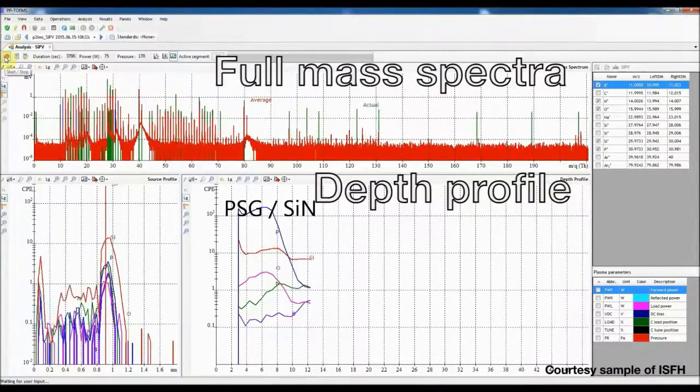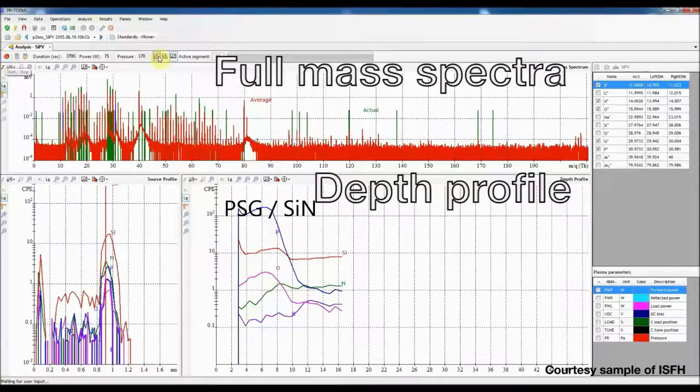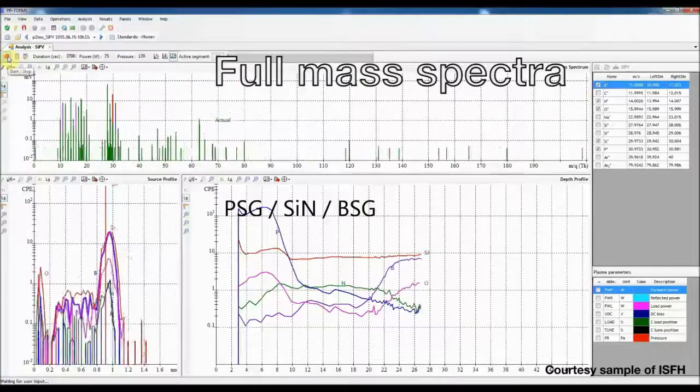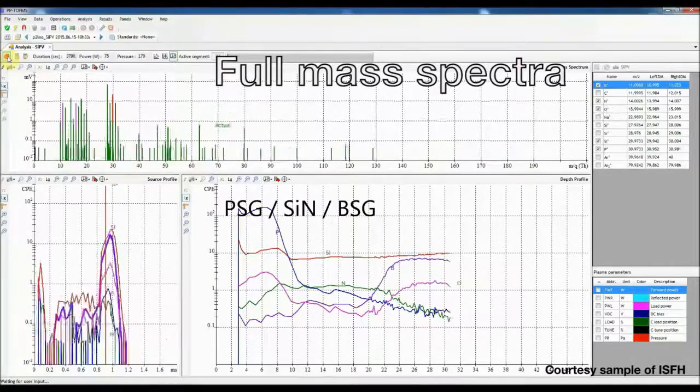You can see first a phosphorus-doped silicon oxide, followed by a silicon nitride layer, and then a boron-doped silicon oxide layer before the silicon substrate is reached.